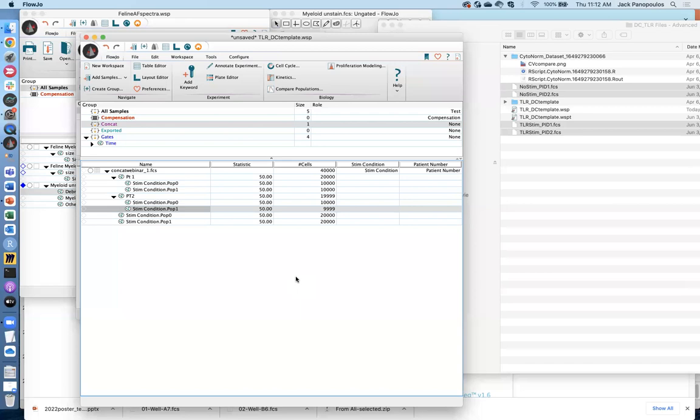if there's no stimulation condition or any kind of agonist that's being applied to the sample, you're basically going to need tumors that were collected on day one and a replicate of that, and then tumors that, let's say, are collected on day 7 and a replicate of that.